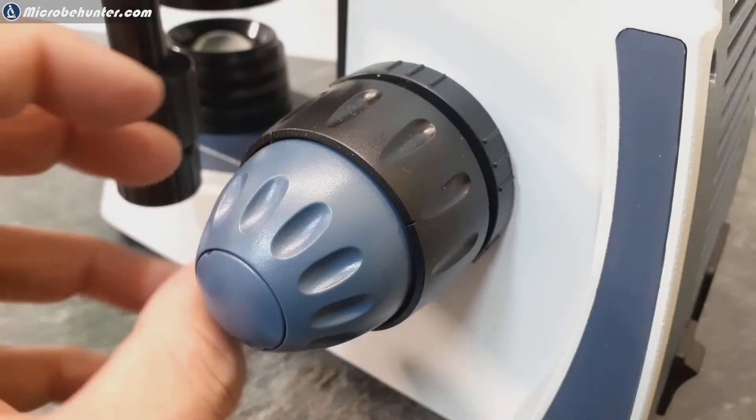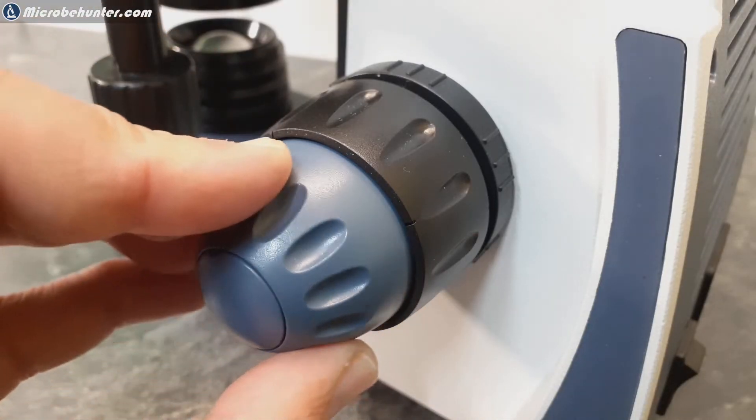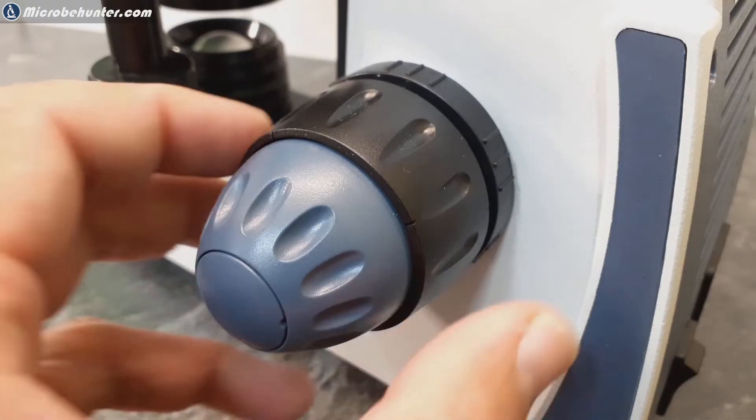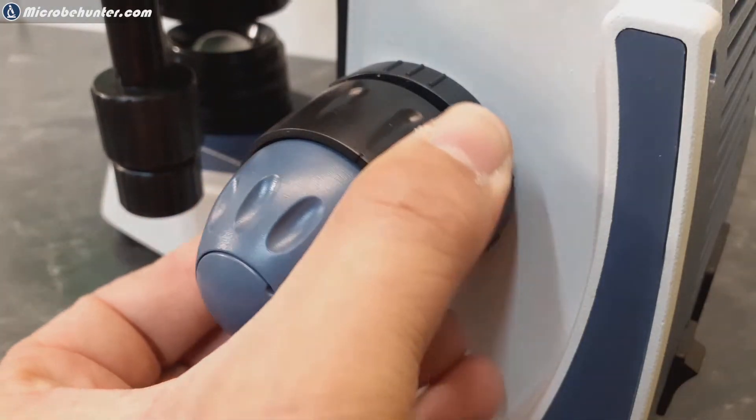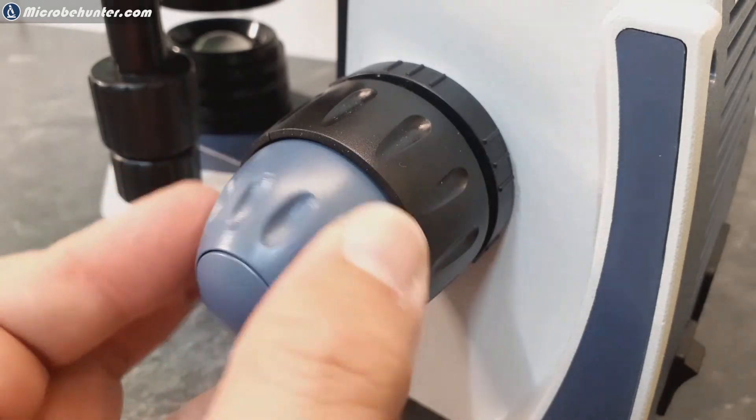There are certain microscopes where they're mechanically coupled, and that's not a problem really, but I just feel that this feels more precise and less spongy. I've seen some microscopes that when you turn them it feels a little bit soft and spongy, and this is definitely not the case here.